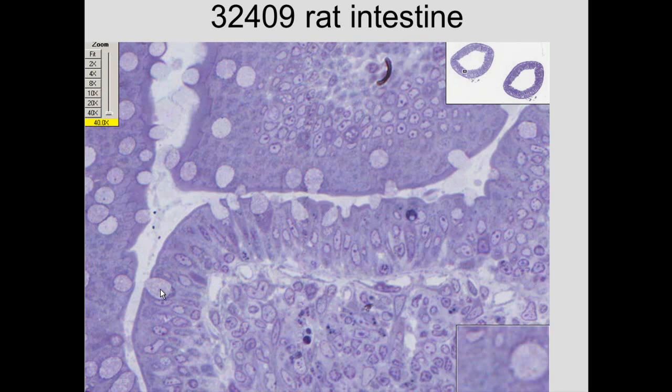Now, unlike the other specimen with H&E, mitochondria can be seen. These clumps or clusters of organelles right here are actually mitochondria. So these are mitochondria at the tip. Mitochondria are needed for absorption of foodstuff, for ATP production, for transport of things in the lumen.